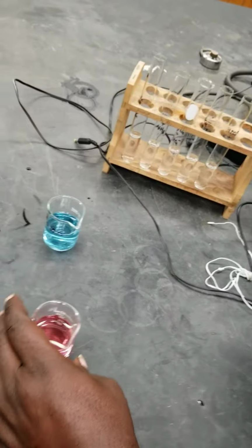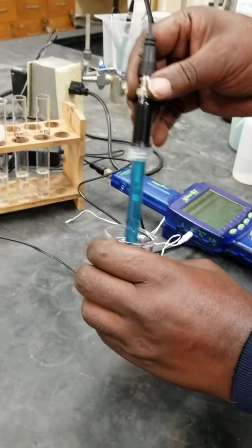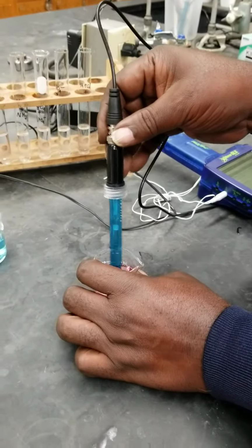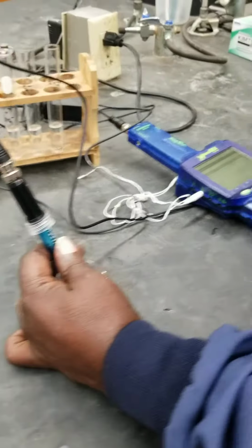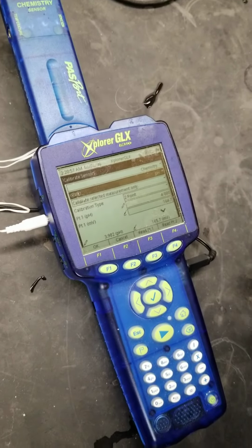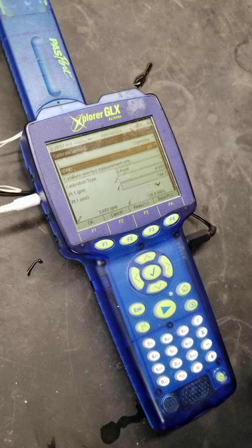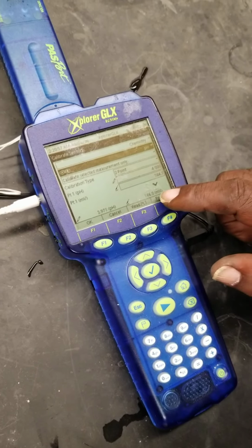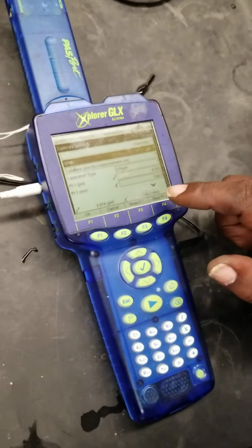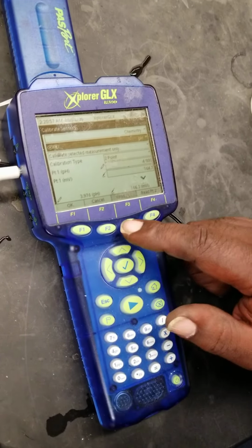So right, let's go into pH number 4. We go in there, swirling gently. The pH electrode is pretty sensitive. So I go in here and it says I need a 2-point calibration, and the pH is 4, so that is correct. And I look down here and I'll see that it associates a certain potential with this pH. At this point, I'll say read the first point.